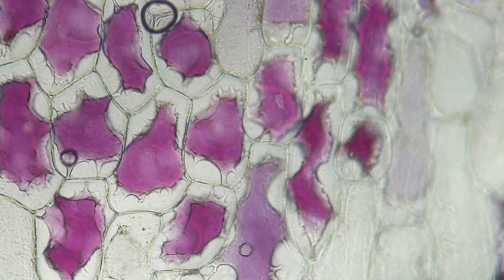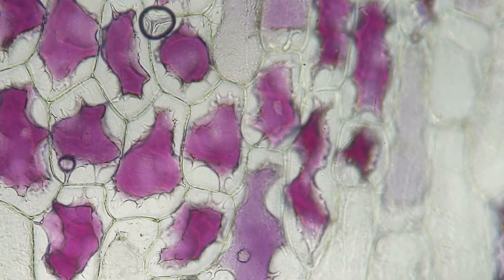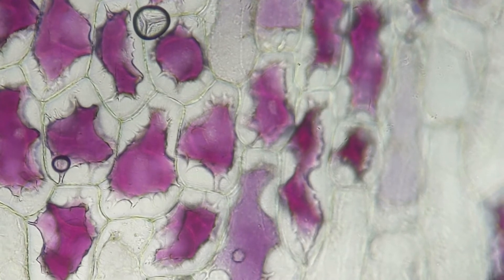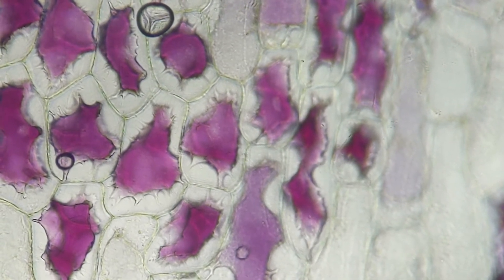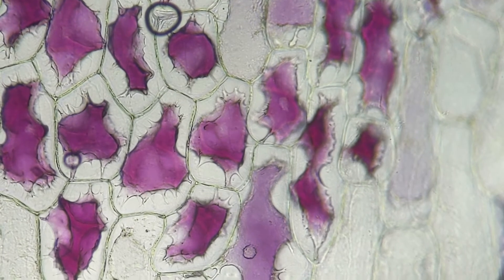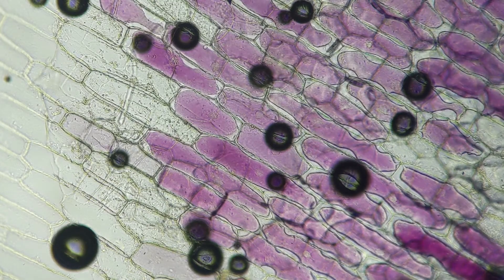This is one of my all-time favorite plant cell observations — the purple onion plasmolysis. It's awesome to see how putting the cells in a salt brine allows students to visualize hypertonic and hypotonic conditions, the movement of water through cell membranes, osmosis, and also some of the anatomical features of plant cells — the idea that the membrane is not the same as the wall. You can see the wall maintains its rigid shape, but the membrane is very plastic or squishy.